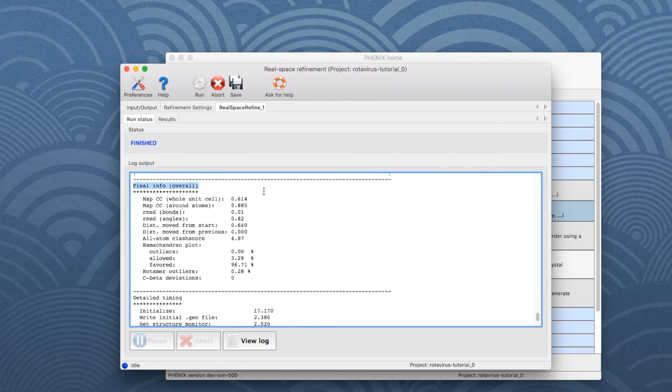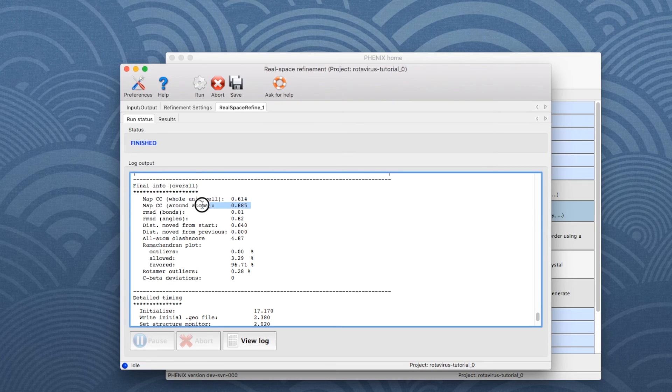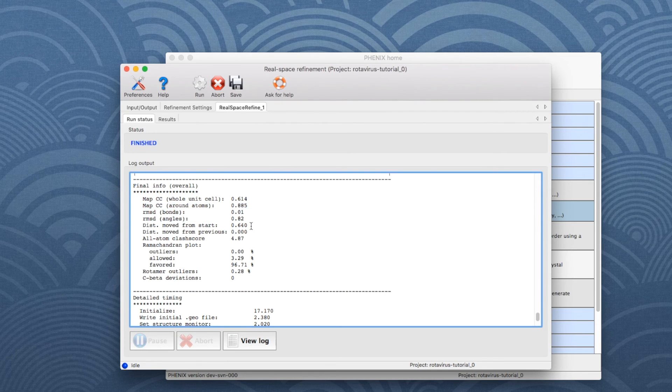Here is a list of refinement statistics and model quality indicators, such as map correlation coefficients, bond and angle deviations, and information about geometry outliers.